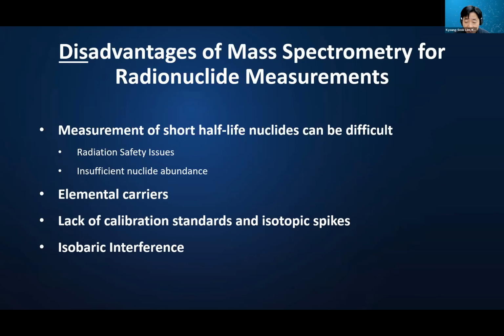We know that, for example, the activity concentration and the mass can be comparable between these two techniques. It can be reproducible and consistent with each other. Then we can use those two techniques for these radionuclide measurements. Yeah, just a simple comment. Thank you very much.